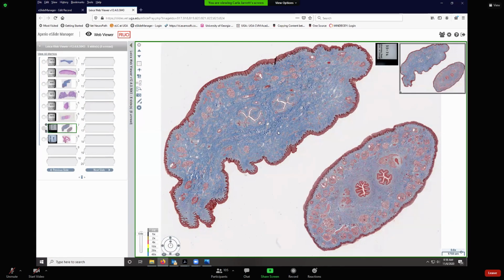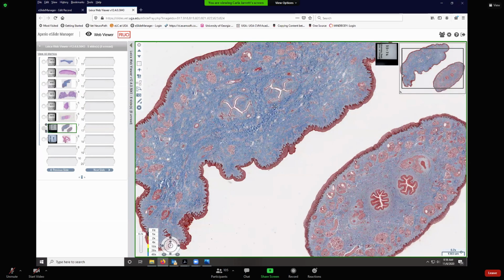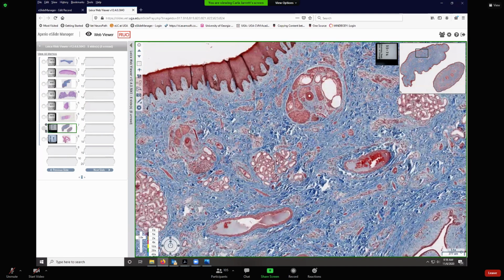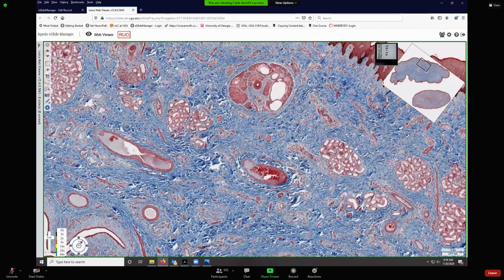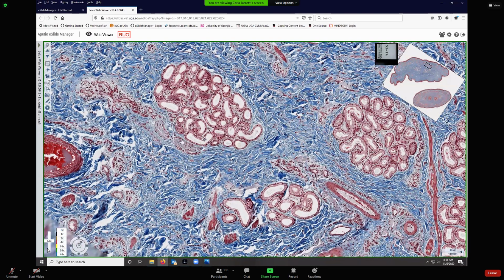that's just more practice. This is closer to the body. This is further away from the body. Just a mare teat, and it's a way to practice more glands. You know how horses like to do things a little differently? So their sweat glands are just massive because horses sweat a lot.